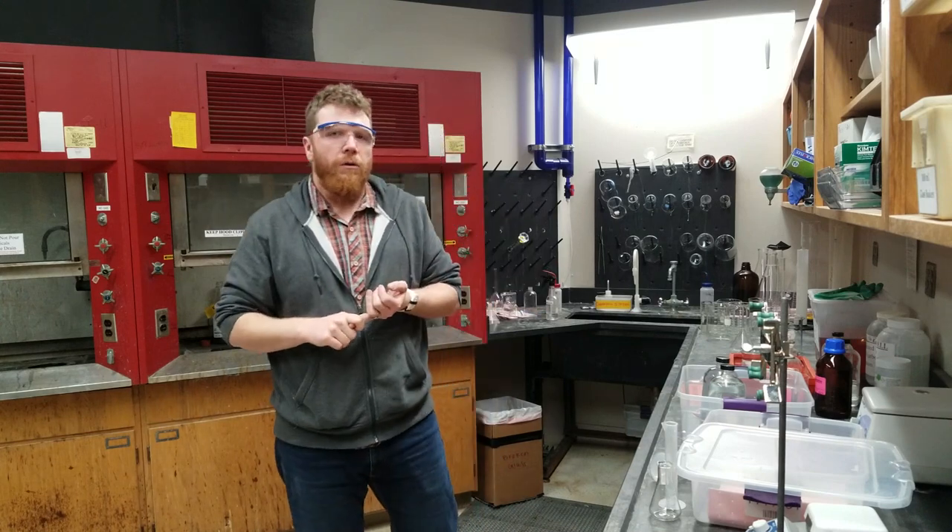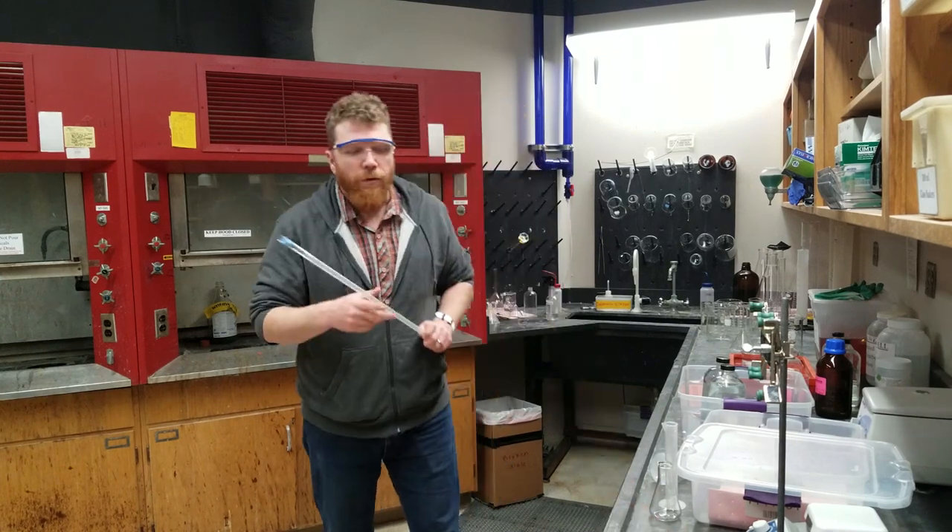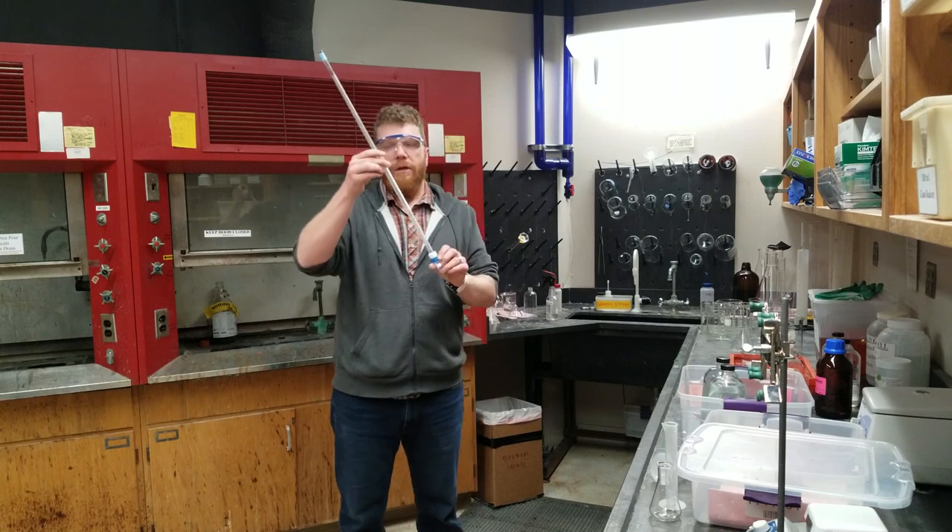There's one other piece of glassware that you will be using this week, and in order to use it, you need to go to the stockroom and check it out. Go to page 63 in your lab manual — that will have a form that you fill out, sign, and get your TA or instructional assistant to sign as well. You will have to fill that out completely.